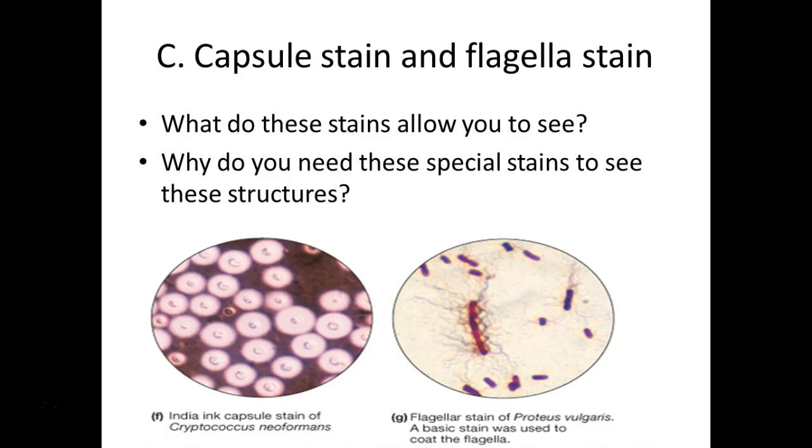Okay, flagella, so this is actually a bacteria. The bacteria, by the way, under our light microscope, they're about the size of the limit of resolution of our microscopes. So we just about see them as separate cells. That's it. Their flagella are smaller than them.